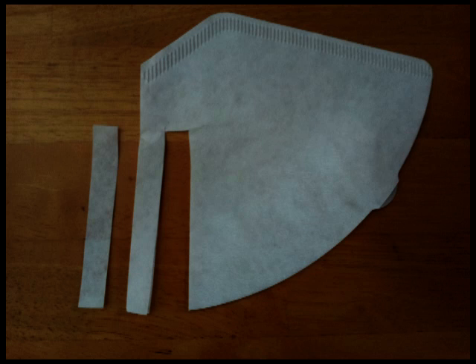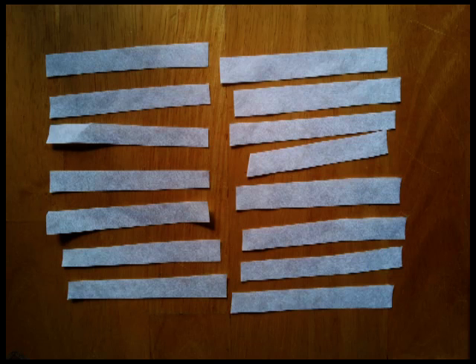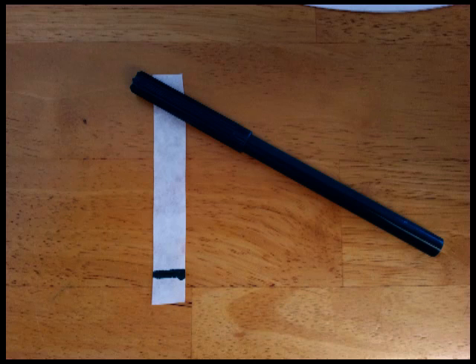Cut the coffee filters into strips and each student will need one of these strips, a felt tip pen and a little bit of sellotape. The first thing they need to do is take their felt tip pen and draw a line across the bottom of their filter paper strip.